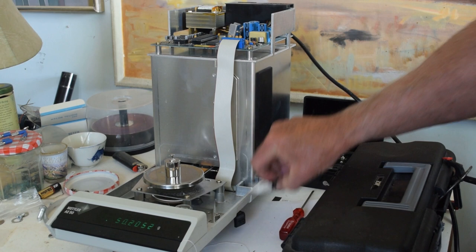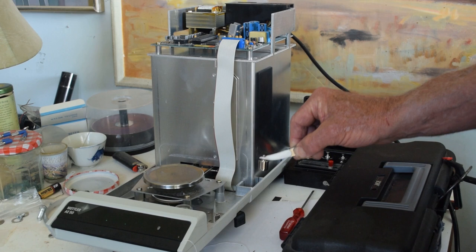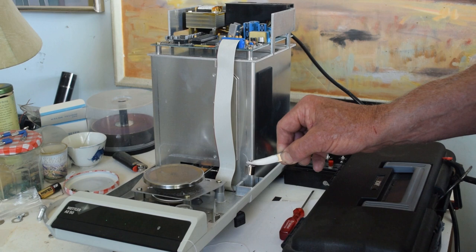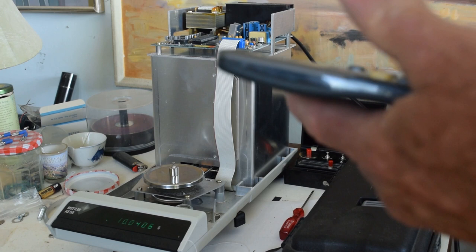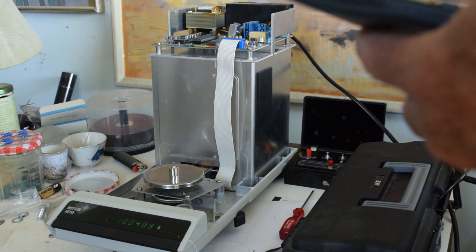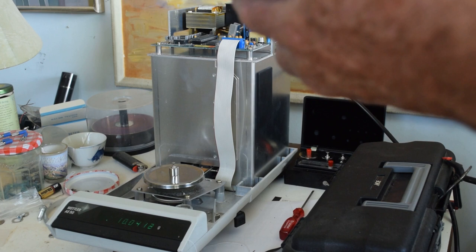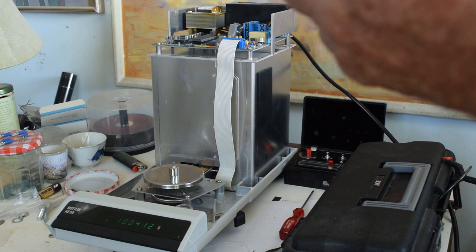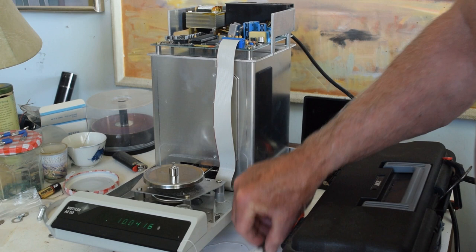Then you can multiply other weights by that multiplier — I just store it in the calculator. Then I can take another weight, zero it — say this ten gram weight — put it on there, and take the value I get, which looks to be 10.0412. So I take 10.0412 times recall, and I get 10.0003 as my value. So this is actually weighing within a milligram, quite effectively.